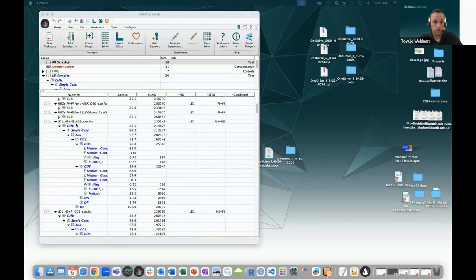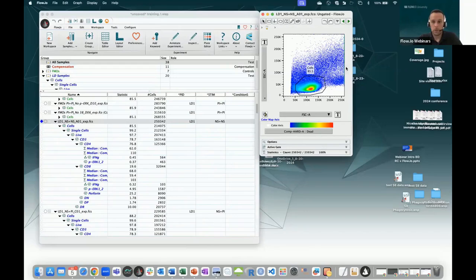I can do anything on this file. I can open graphs, I can adjust them. The thing is, it's just going to take a little bit more RAM from my computer. My computer has 16 GB of RAM, so no issue there, but maybe your computer has only 4 GB of RAM, and it may be an issue in your case.